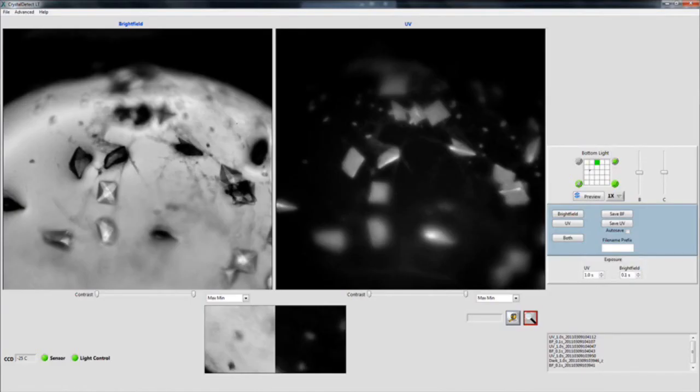And here we show that the scan is done. The green wells indicate that the scan is finished. And we can clear those, and we can proceed to running the entire plate if we need.